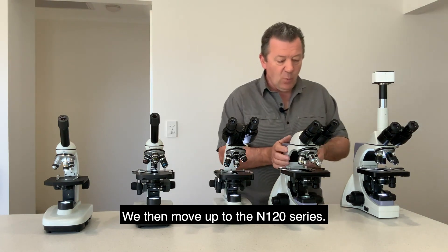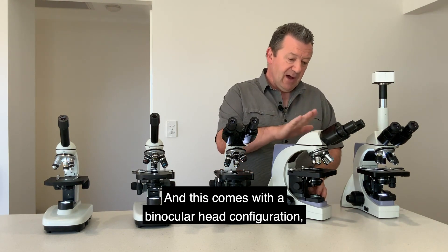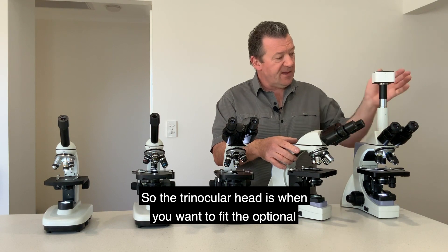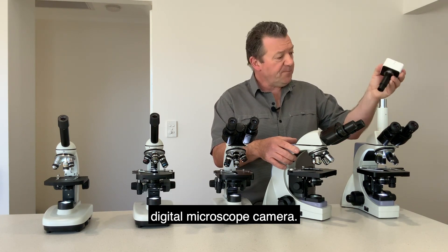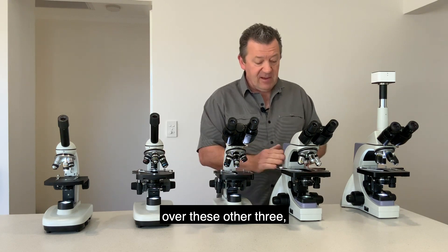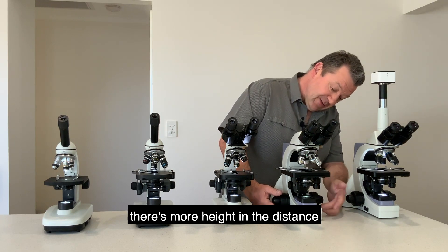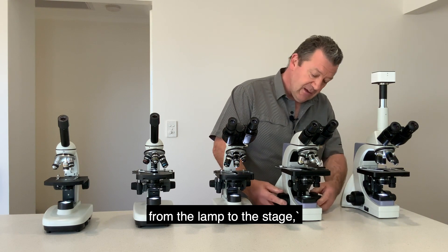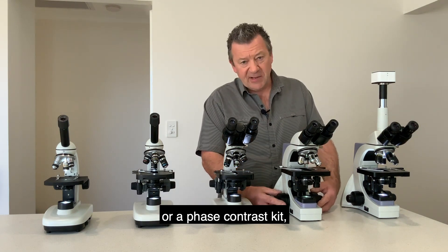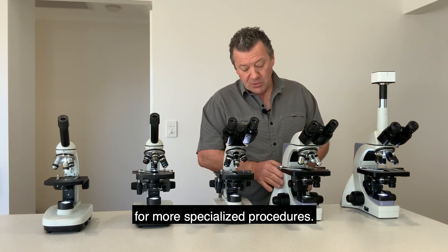We then move up to the N120 series — this is a physically larger microscope and comes in a binocular or trinocular head configuration. The trinocular head is for fitting the optional digital microscope camera. Other advantages include a larger mechanical stage, more distance from the lamp to the stage, and the ability to add accessories such as a dark field or phase contrast kit, offering more options for specialized procedures.